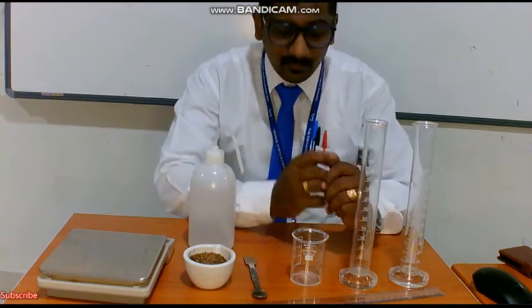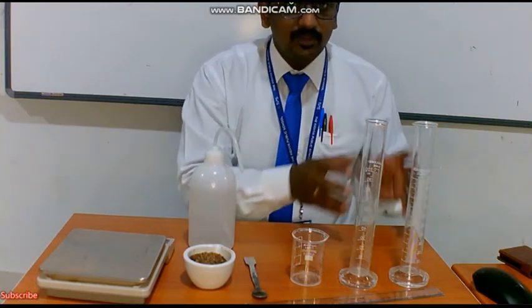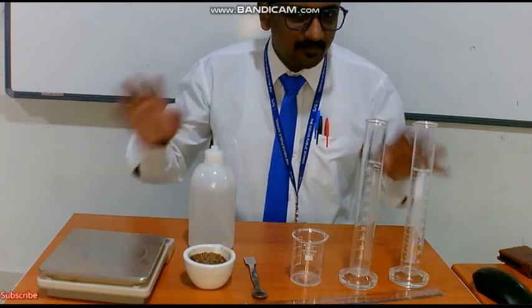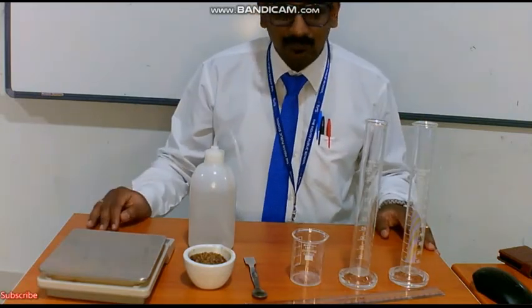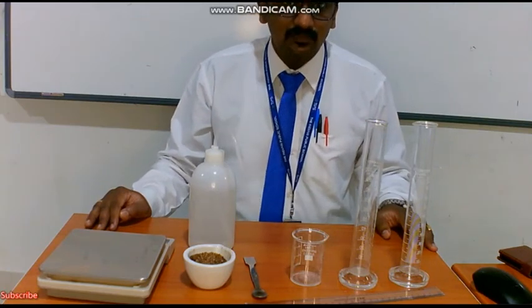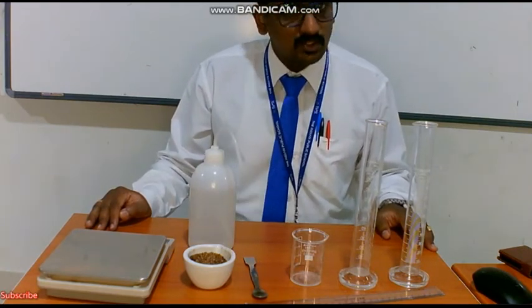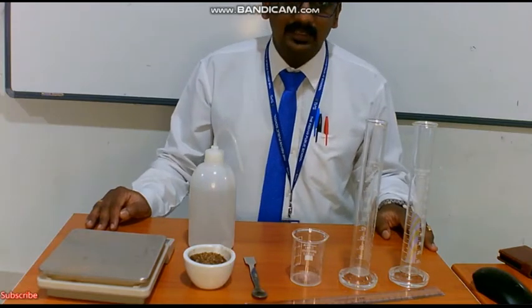So what we are going to do in this practical - we have about 4 sets of experiments in it, about water profiling test. We have soil texture, soil water holding capacity, soil moisture, and soil pH. 4 different practicals are there.